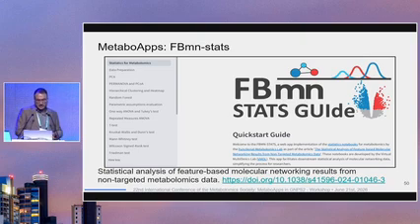And the last one, I'm not going to discuss the details, because for that you need not only the information about how GNPS2 works, but also the statistical background. So I'm not going to discuss the theory behind all the statistical tests, but for those who are not familiar, especially those starting in metabolomics, it's a really good guide, because it not only provides many of the most common tools, even for modeling, like some supervised and unsupervised tools, but it also provides a written guide along with the tool.